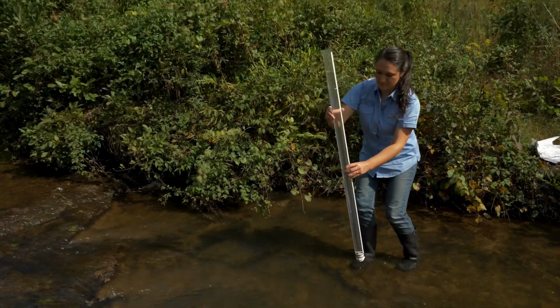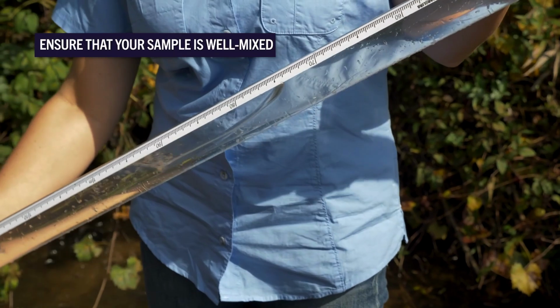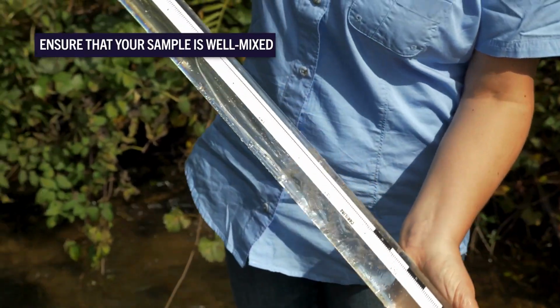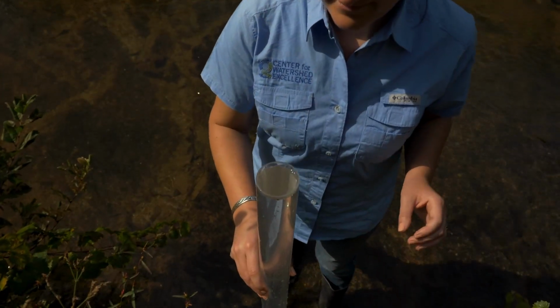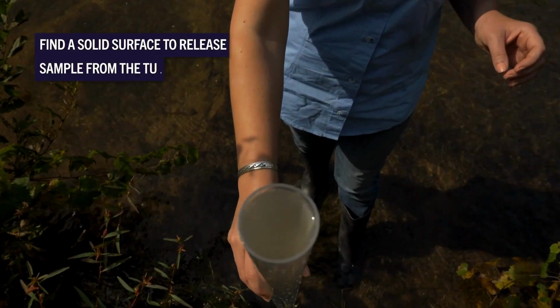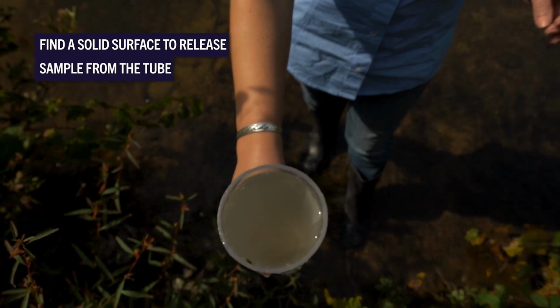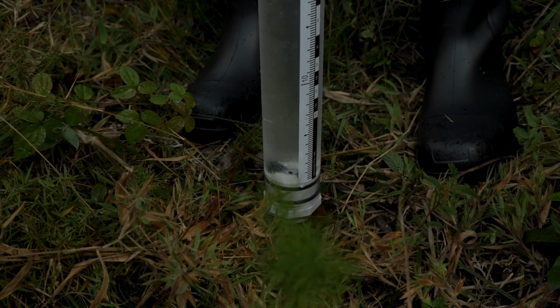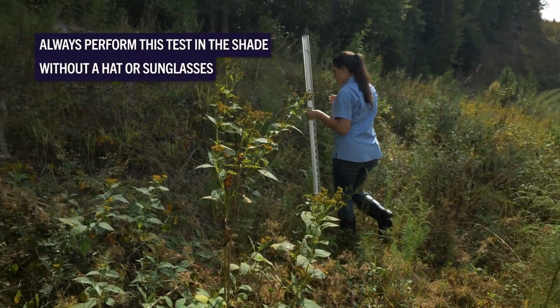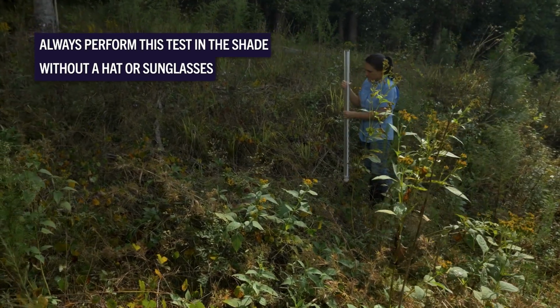Fill the tube with your water sample. Your sample should be well mixed, so feel free to cover the top and redistribute the water. For our model, the tube has a release valve at the bottom, releasing sample water when pressed down. This should be done on a solid surface, such as a rock. If you do not have a rock nearby or in the stream, carry a brick or find a sidewalk.